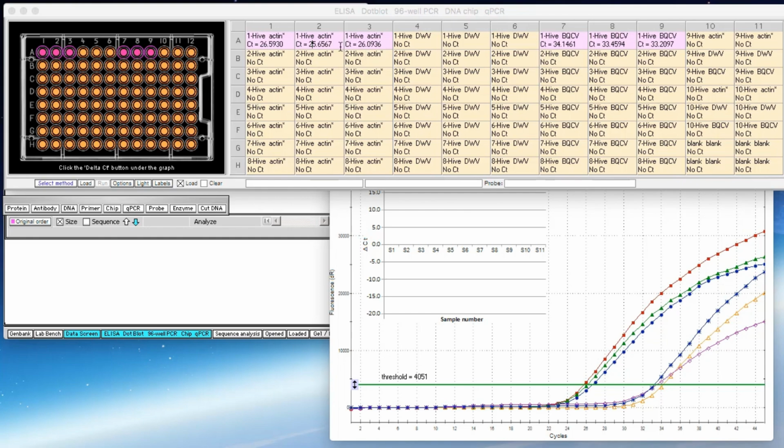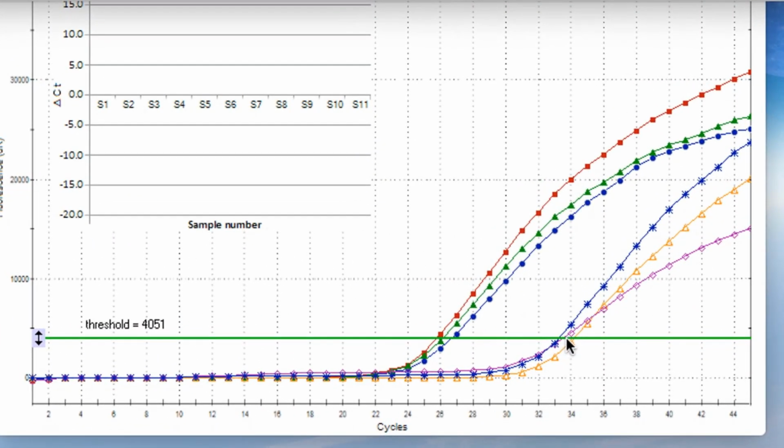Now notice, just visually looking at these, 26 versus 34, and you can see the difference here. So I'll just hold in this particular region just to get an idea for these wells. I can get that to work, 32.5. So roughly 33 for those 3, and roughly in this area somewhere in the vicinity of 26.